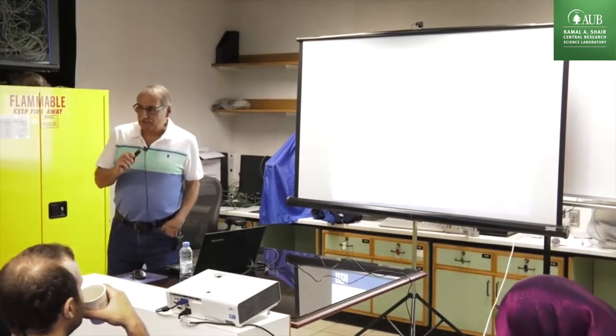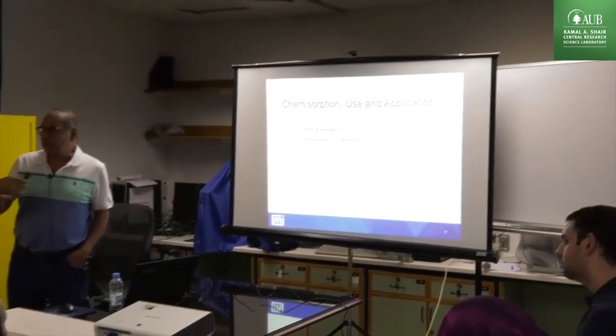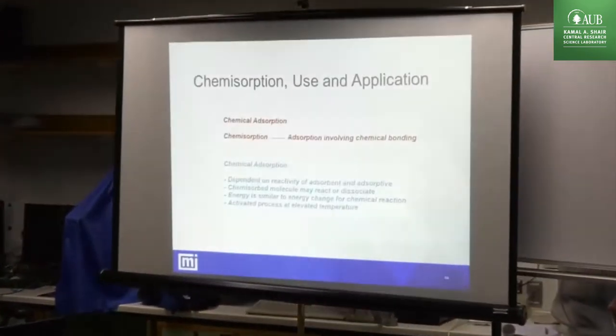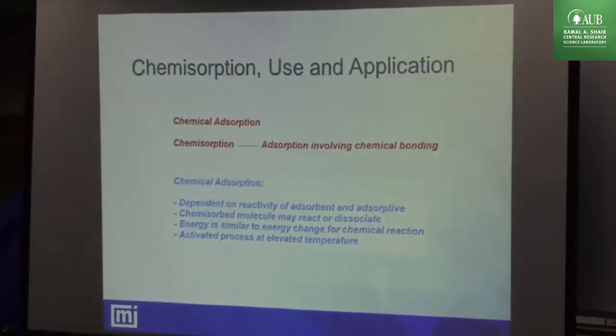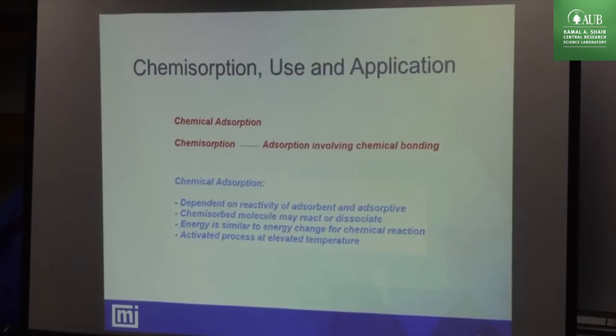Yesterday we saw that physisorption is a physical adsorption where we have reversibility. So we adsorb and desorb. You know, the adsorption and the desorption. We have seen the adsorption isotherm, and the desorption can give us information about the shape of the pore. Chemisorption is a real reaction where the heat of adsorption is very high. What that means is it is irreversible. Once you adsorb CO, for example, you form carbonyl and you cannot take it out. This is why our reference material cannot work for a long time, because once you make the chemical reaction, it's very difficult to reverse it and remove the CO from the nickel.